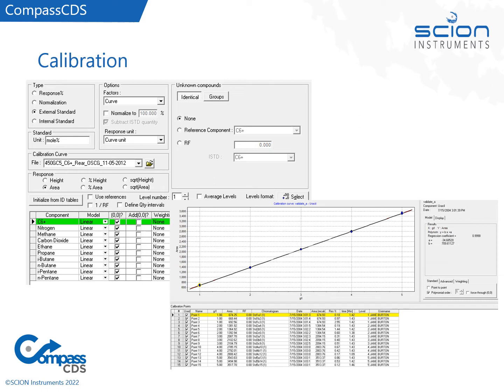On the slide, we can see some further information on the calibration that we just observed. Here, we can see that there are several different types of calibration curve that can be selected. We can choose whether it's an external or an internal standard, the standard units, the response units, various different reference components, the calibration curve save file, the response type, and various other parameters, such as the weighting to be applied.